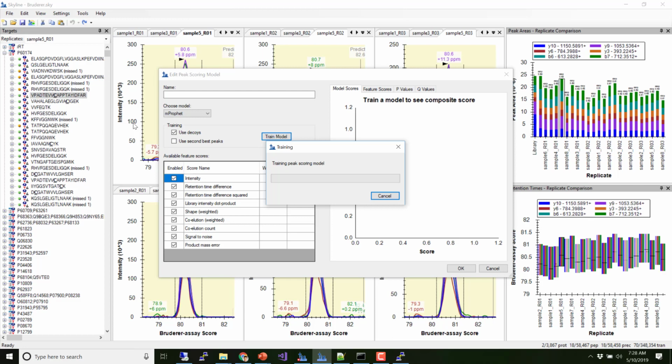And this is something that can happen all automatically if you're using the command line. So this is where I got kind of tired of pushing Skyline through big data sets, having to click the same button a bunch of times, and that's where I started switching to using the command line a lot, like I showed you earlier.